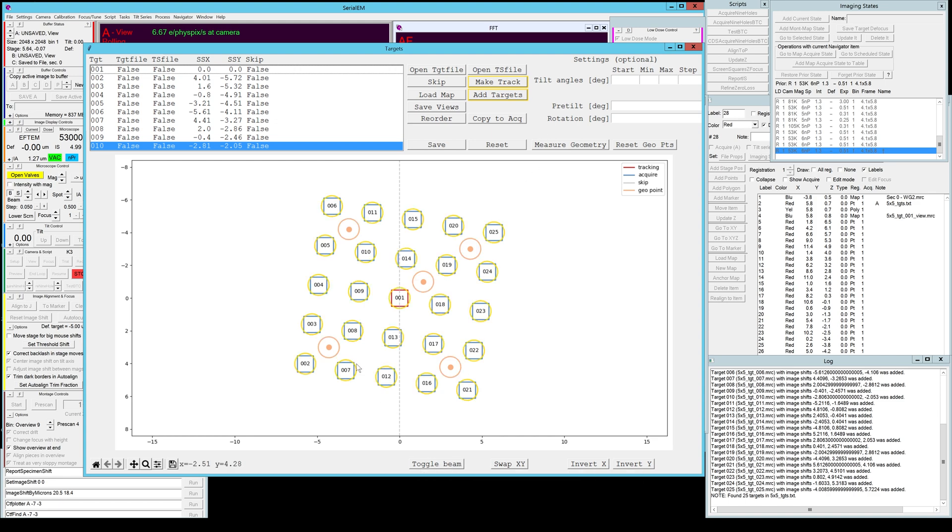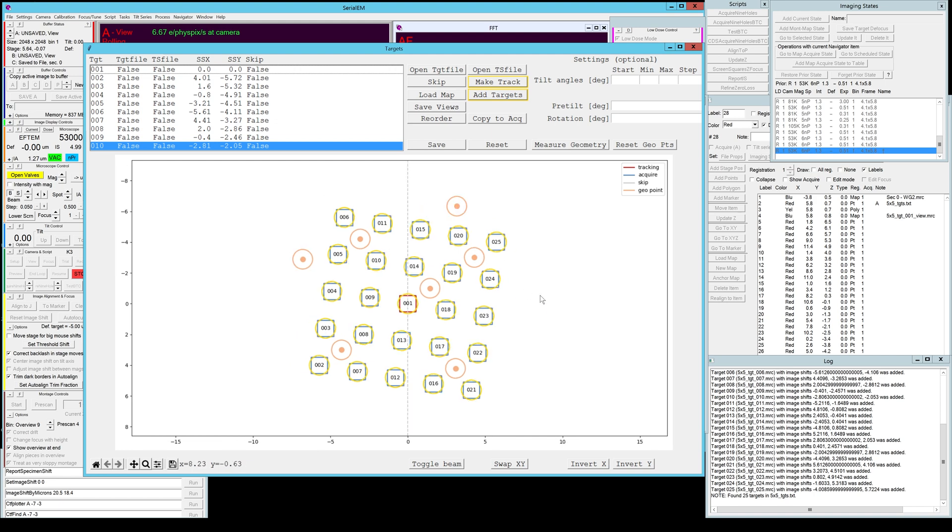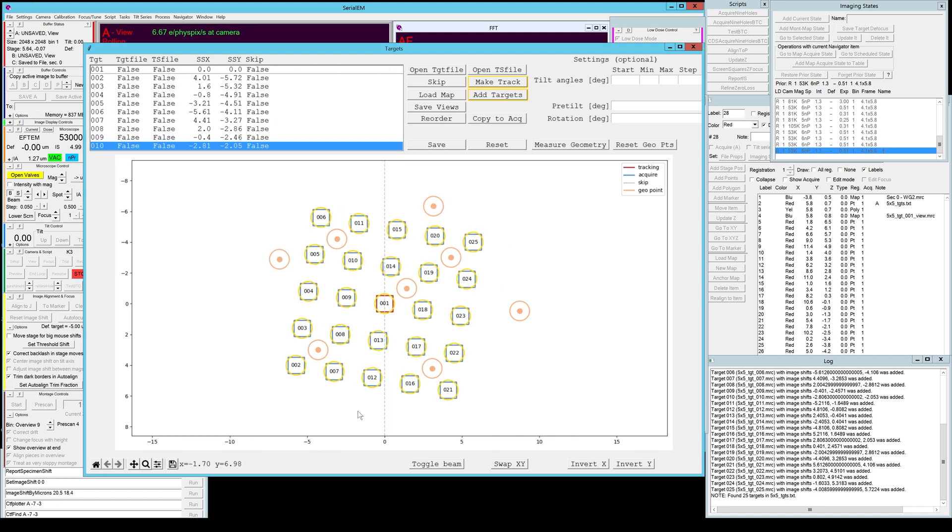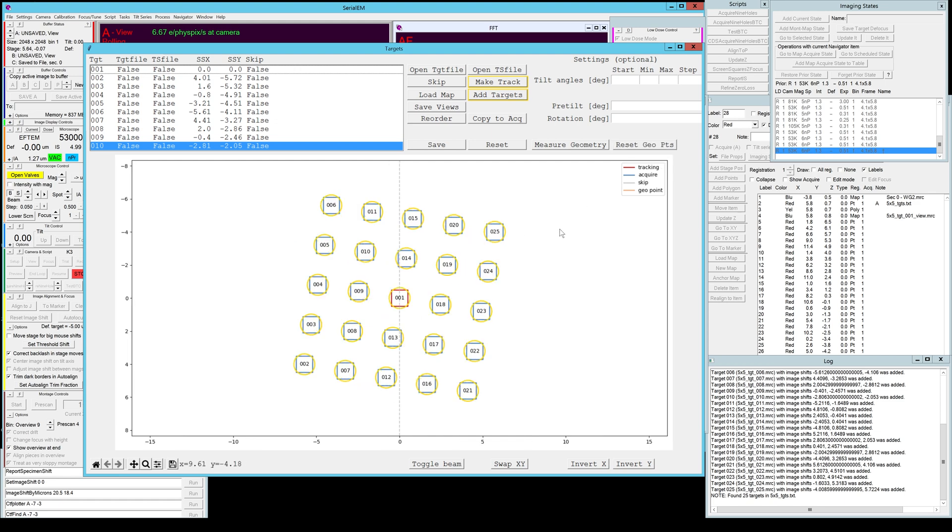You can also toggle the beam diameter again to make sure that these points are not overlapping with your actual targets that you want to collect on. If you really want to and you know you have space you can actually add more geo points by hitting the middle mouse button on the plot here and of course you can reset them again which will delete all of them.